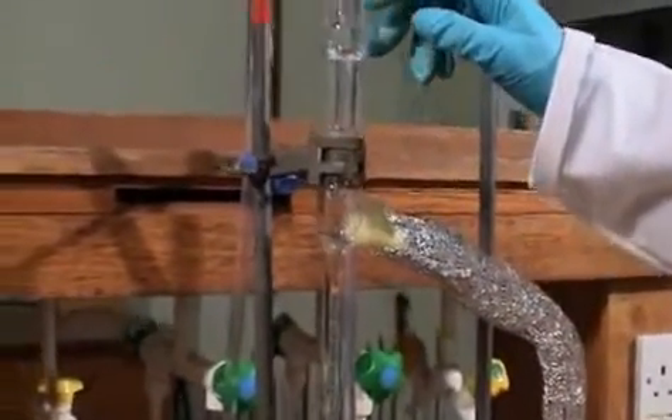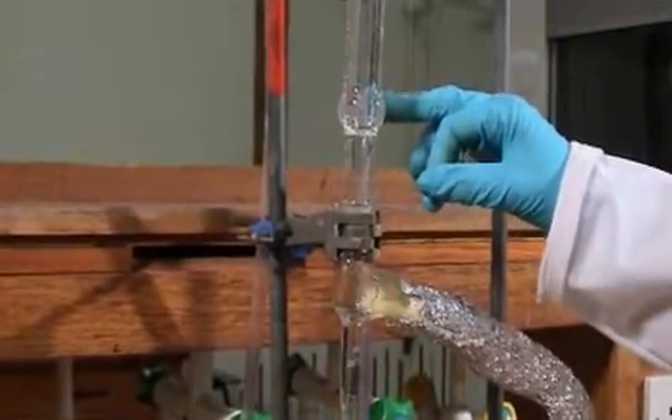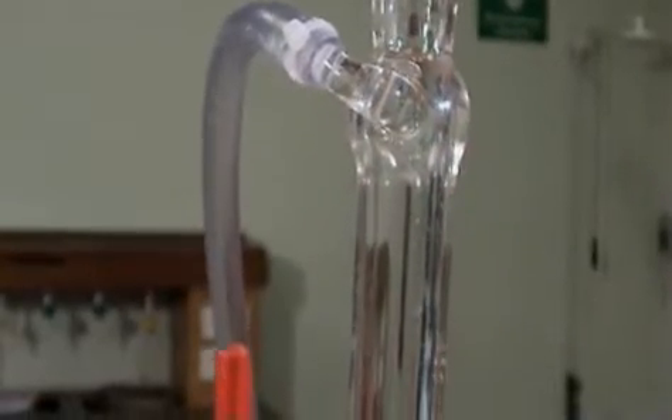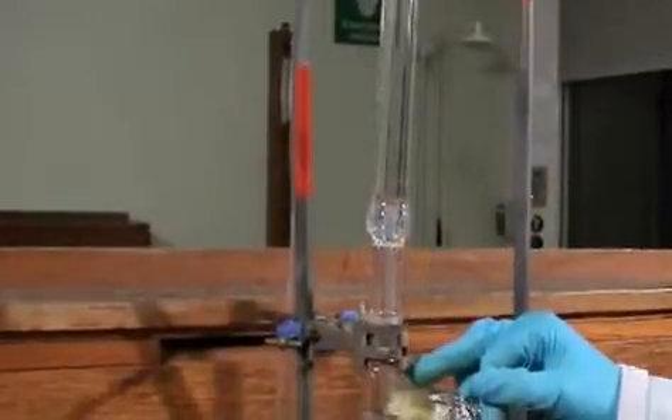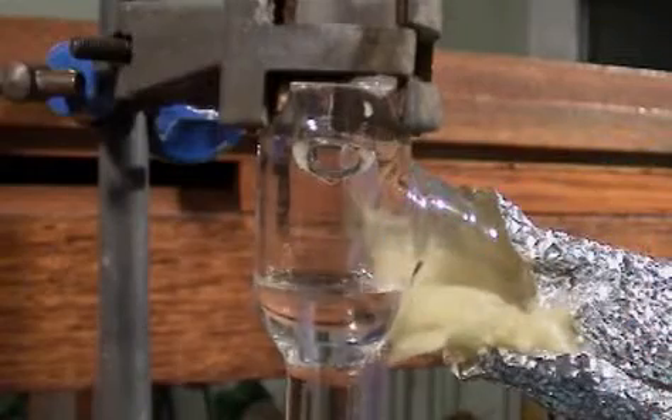A reflux condenser is attached to the top of the Dean Stark apparatus. The water is going in at the bottom and out at the top. You can see that we've put clips on the tubing. The solvent is just starting to reflux and drip down into the sidearm of the Dean Stark.